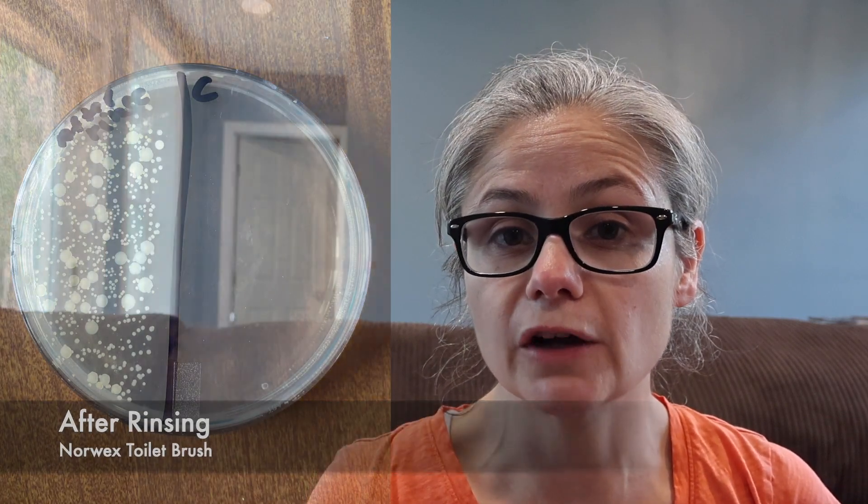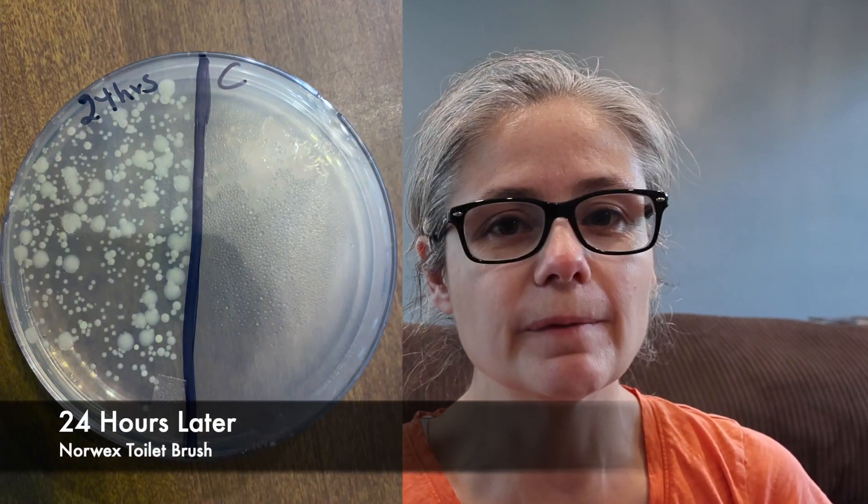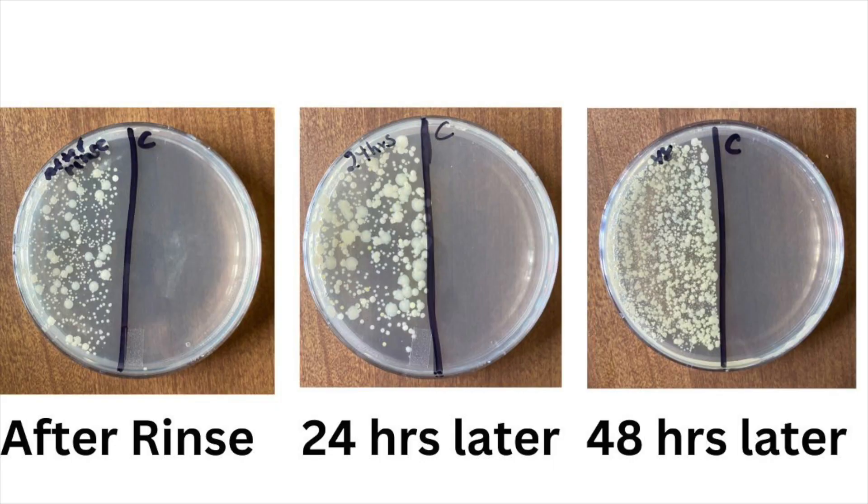After rinsing with water, we can see a bit of a decrease in bacteria on the toilet brush. At 24 hours later, there's still quite a bit of bacteria on the brush, and at 48 hours later, again there's still quite a bit. Looking at a side-by-side of after rinse, 24 hours, and 48 hours, they look very similar — it almost looks like the bacteria is actually increasing a bit, and it's definitely not decreasing. So the BackLock technology — I'm not certain if it actually works. But before Norwex consultants get really upset and angry at me, let me show you something.